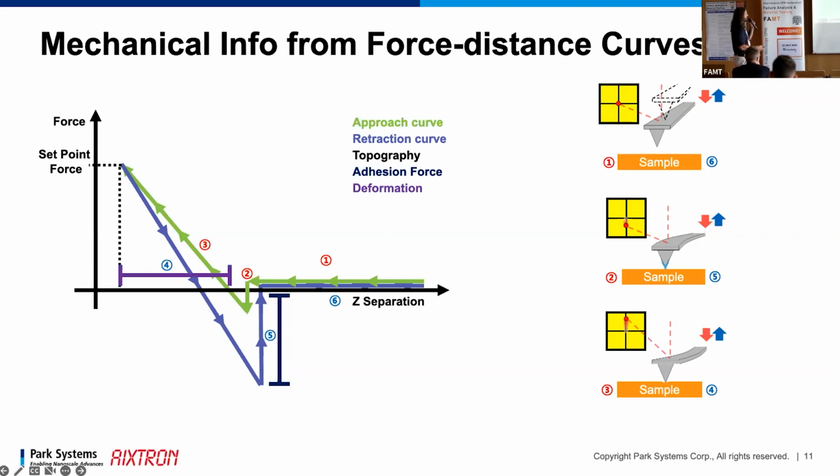force applied. We can also calculate the adhesion energy, which is sometimes important for the surface energy in wetting processes, for example. And we can calculate other values, for example, the energy dissipation, or more importantly, from the slopes, we can calculate the stiffness and the Young's modulus.